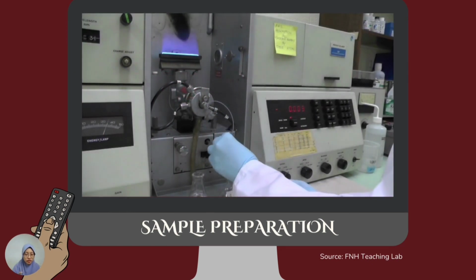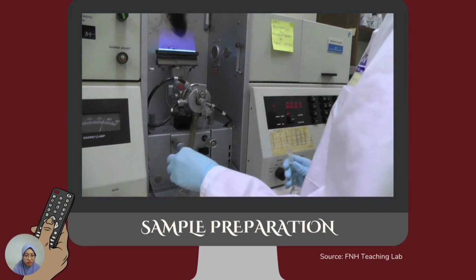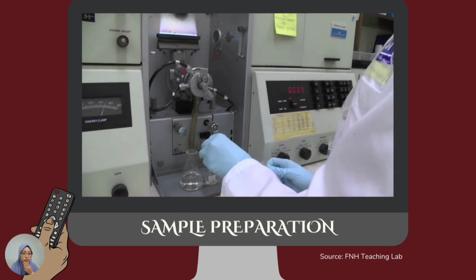You should start with the standard with the lowest concentration. Dip the feeding tube into the standard solution. The flame should turn green. Record the reading and dip the tube back in the DD water to rinse. Continue with all standards, then the sample blank, and finally your samples.